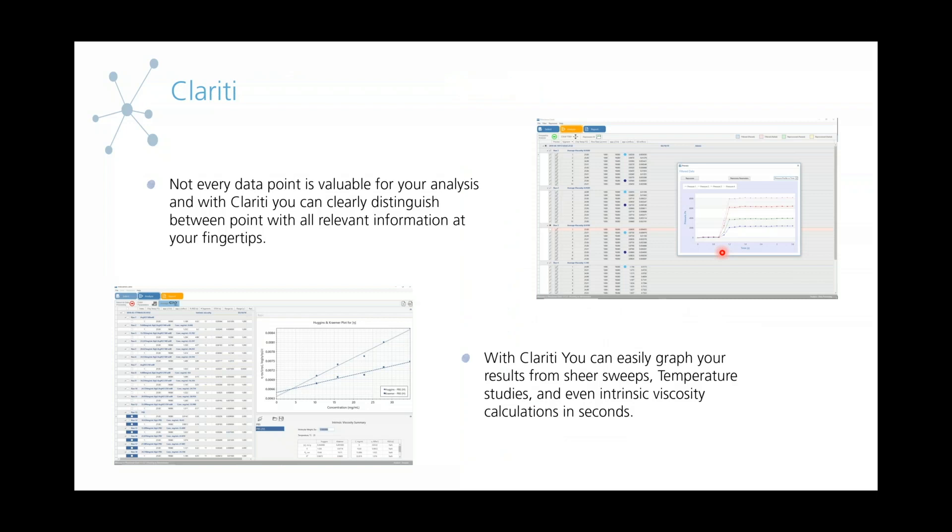The best way to get the best results is with our Clarity software. This is a separate piece of software that allows you to further analyze the data points you get from the Initium, because not every data point is valuable for your analysis — there might have been a bubble or contamination. With the Clarity software, it is fully capable of helping you figure out which data points are good and which ones are bad, to get a better fingerprint of your data. You can also use Clarity to easily graph things, whether it be shear sweeps, temperature studies, and even intrinsic viscosity calculations like the one shown earlier — done with just a few clicks using the Clarity software.